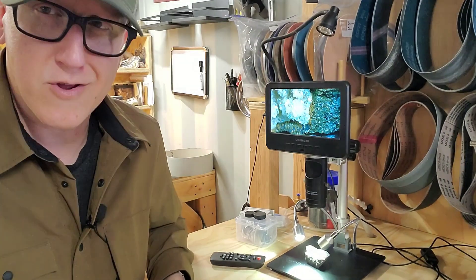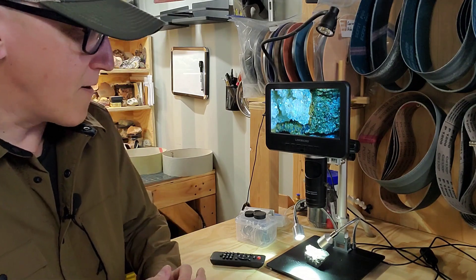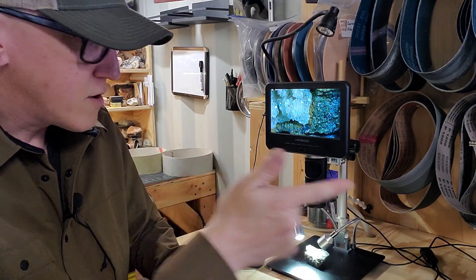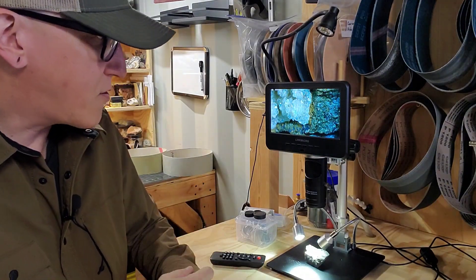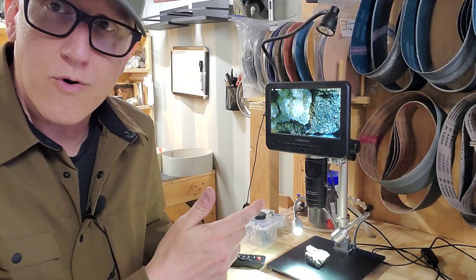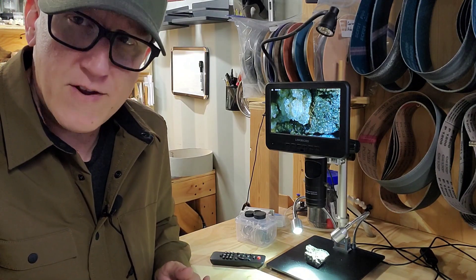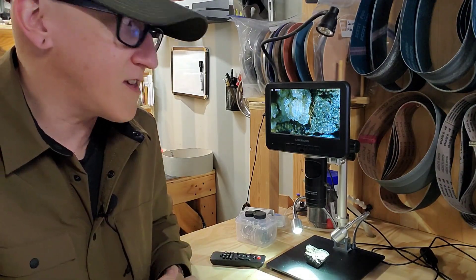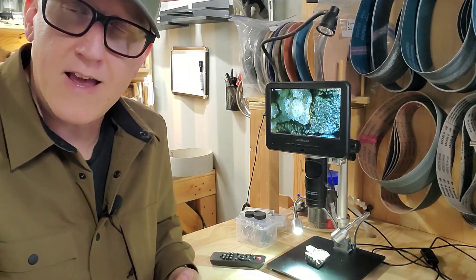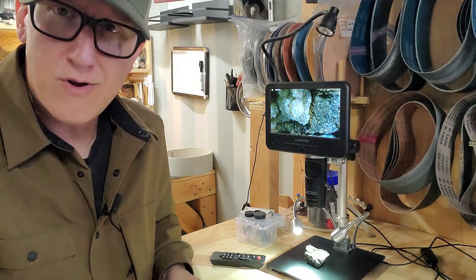Now if we're looking at this purely from the perspective of can we see the structure of what we're looking at, you can still obviously see the structure even with these potato quality photos. That's when I turned my attention to the video aspect of it. It comes with a 32 gigabyte SD card, which is decent, though SD cards are basically dirt cheap on Amazon. A lot of microscope videos out there I'd call 'wow look at this' videos — people get these things for free, put something under it, and they're usually looking at flat things like circuit boards, stamps, or watches, not three-dimensional objects like minerals.